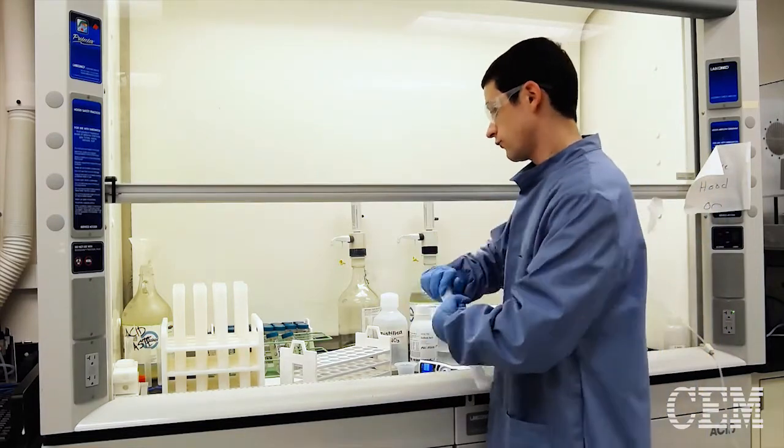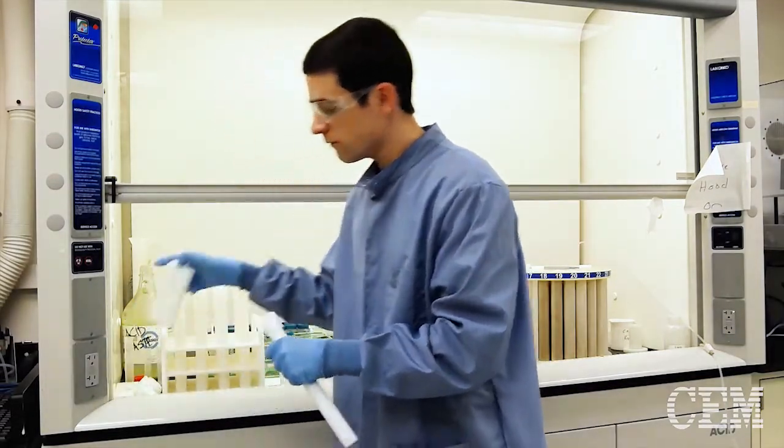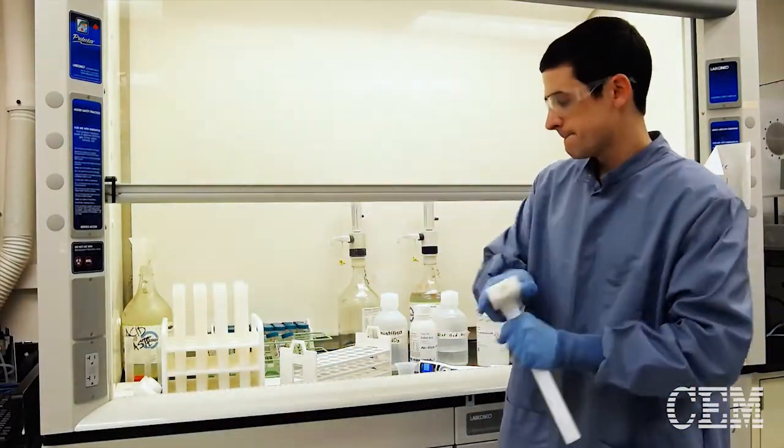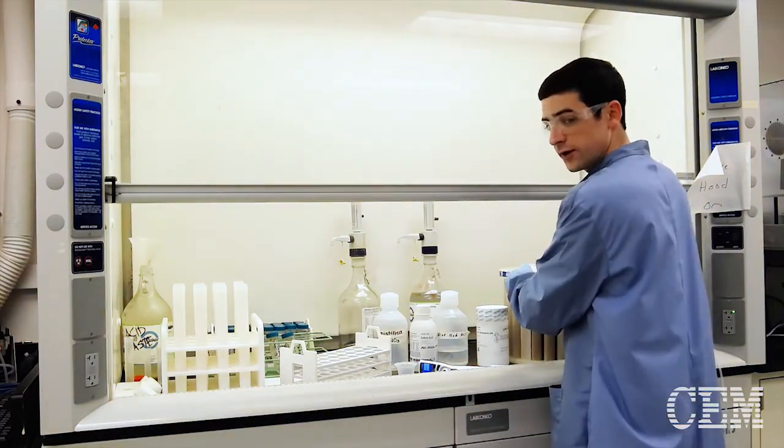All right, so you would seal up your vessel, place it in the turntable, and take it over to the microwave.